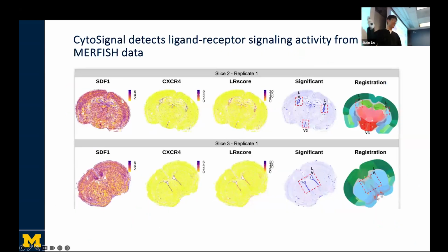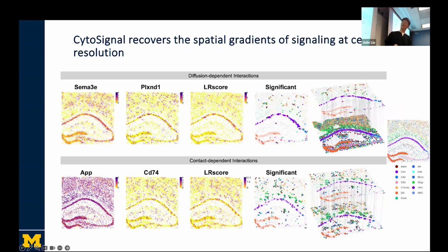And another example is MERFISH. This is another classic technique, a fluorescence probe based technique, which is a little bit different from 10x Visium, which is based on barcode capturing. But we can still do it and identify some really interesting signal enrichment in the lateral ventricles in the brain. And of course, another example is STARmap PLUS. It's another fluorescence-based protocol, and we identify some really interesting things there.